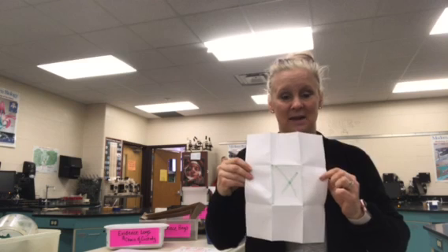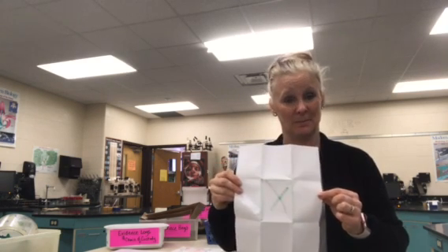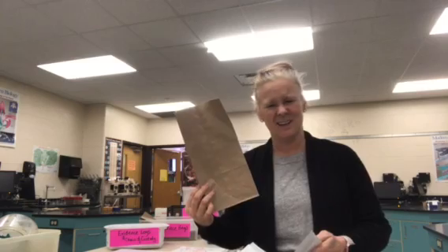I've marked an X on the other side of the paper on that center square because that's where I'm going to put my evidence. So the purpose of the bindle, why would somebody need to use this? Well, if some of the trace evidence that you're collecting is very fine and small, you don't want to just put it into a big paper bag because when somebody goes to open this to analyze it, it's going to be all over the place and they're not going to be able to find it.